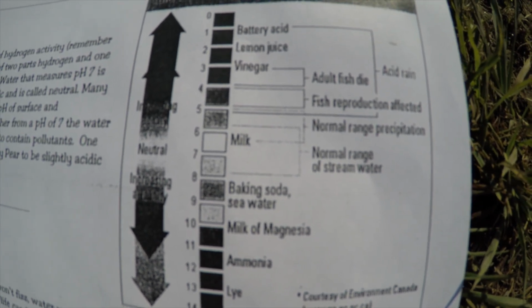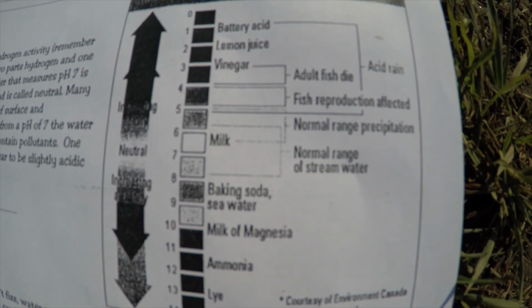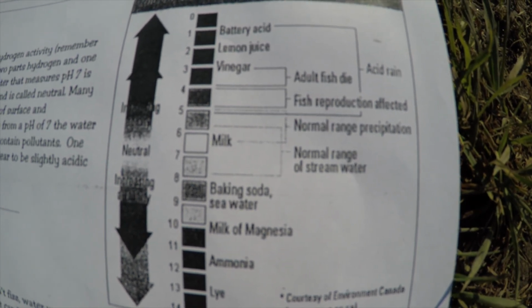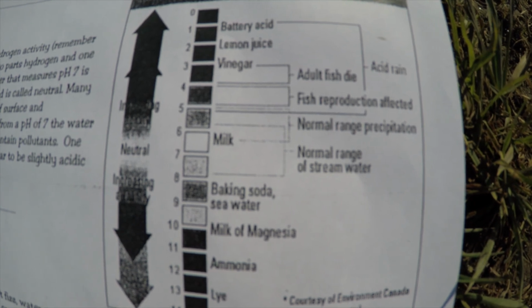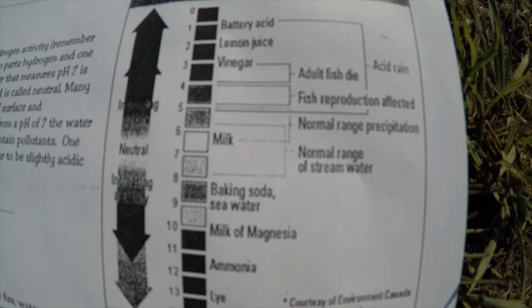Well, one of those I'm sure you've all tasted, lemon juice. The other, battery acid, hopefully you've never tasted. It just goes to show that pH is not a test to see if you can drink it. It is a test to see if it's an acid or a base. So a normal Montana stream would normally be slightly below 7, so slightly acidic.